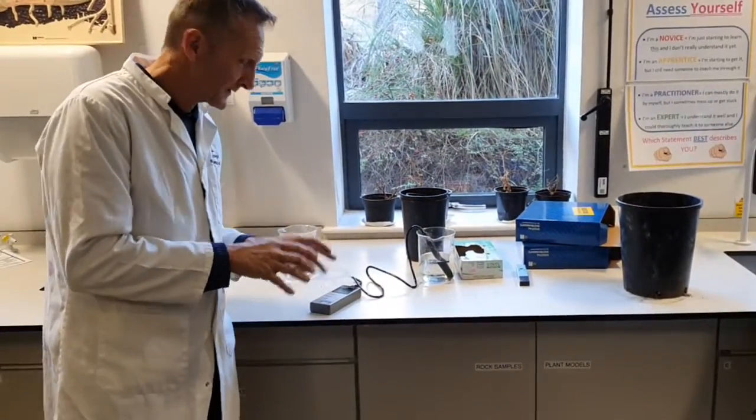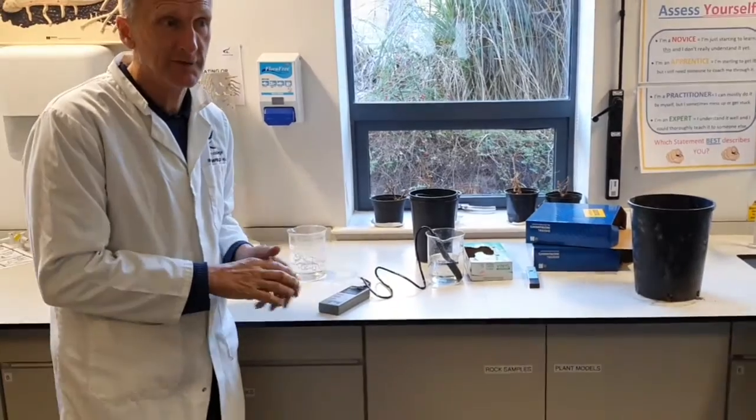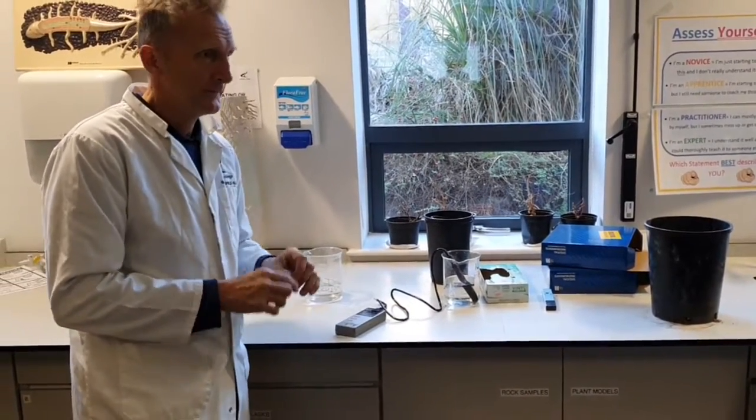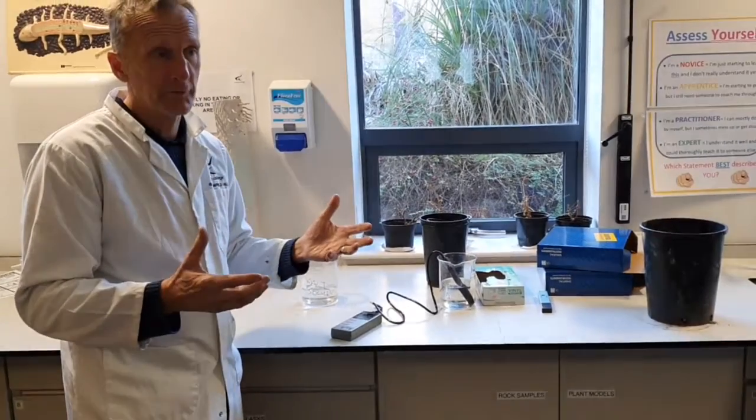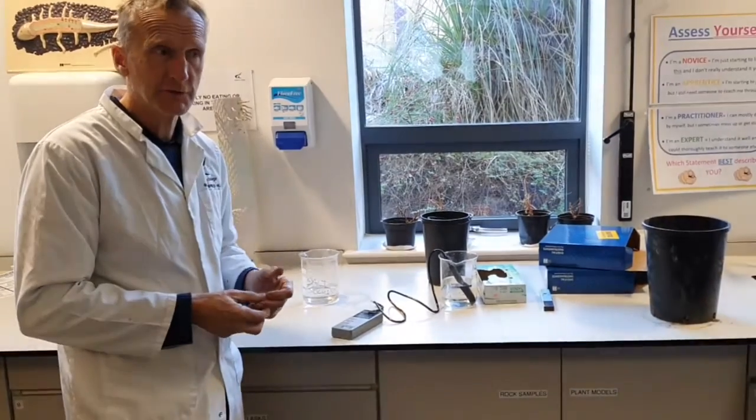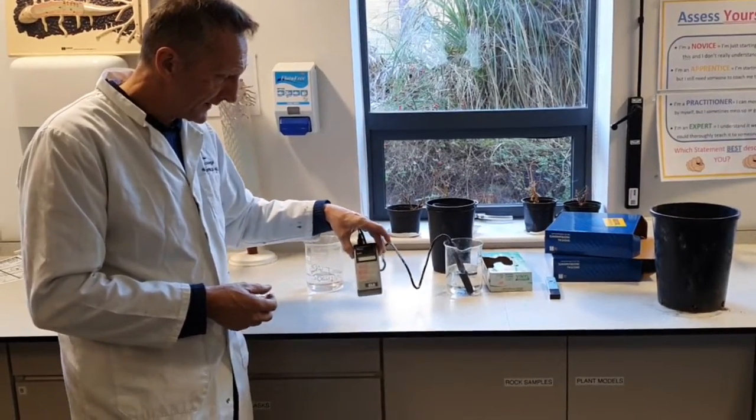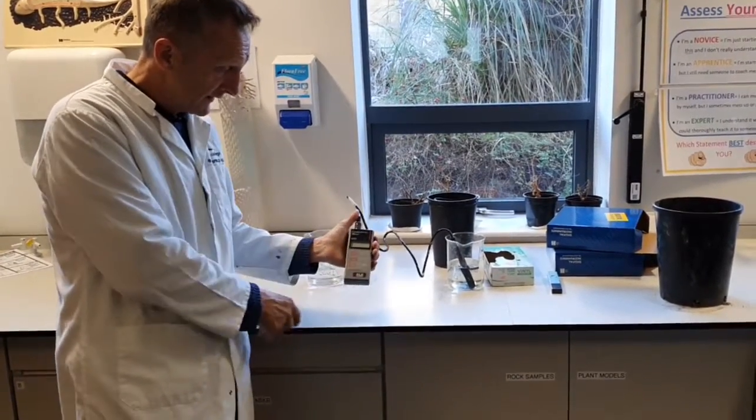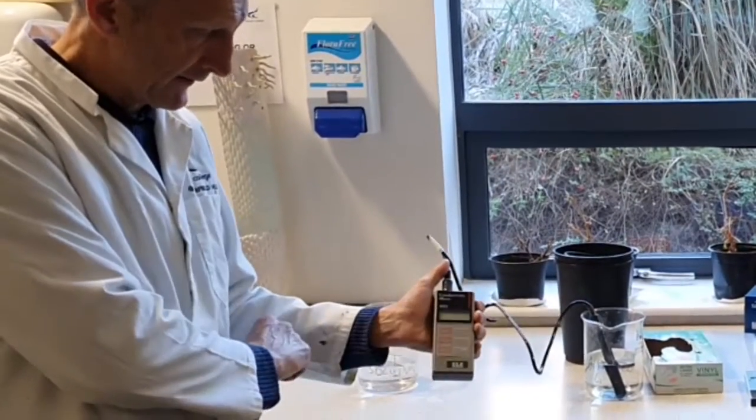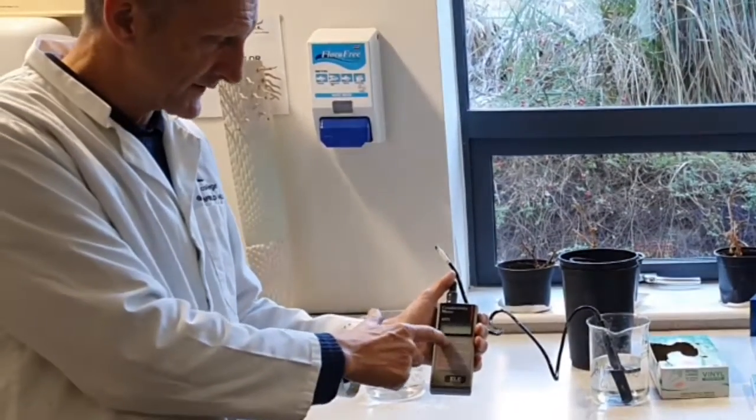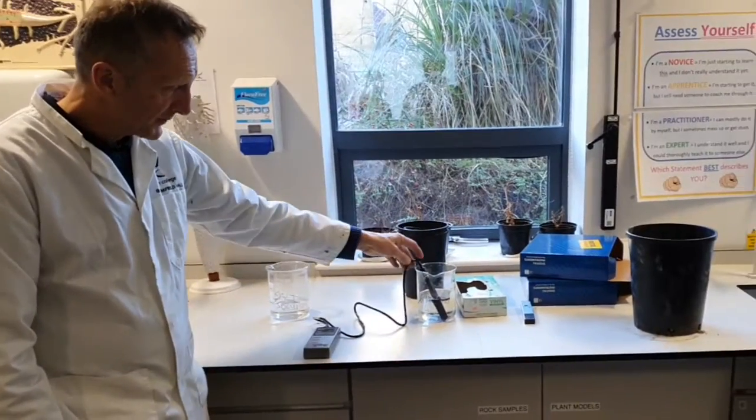We're going to look at soil conductivity, or EC as you might see it in a table. Conductivity is measured in microsiemens and we have an instrument like this. You've got the on button at the top and the off button there. All you've got to do is press the on button.